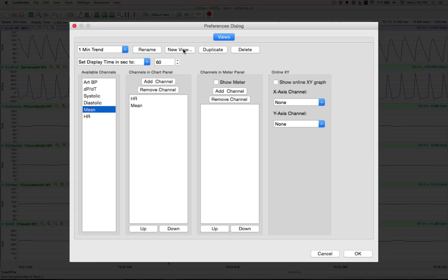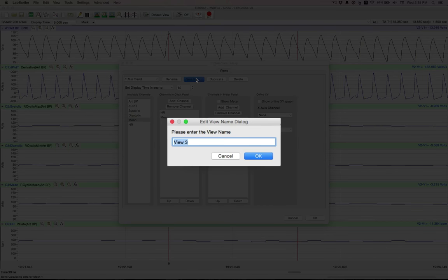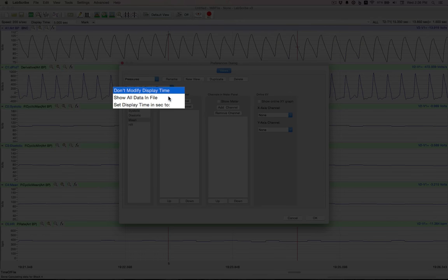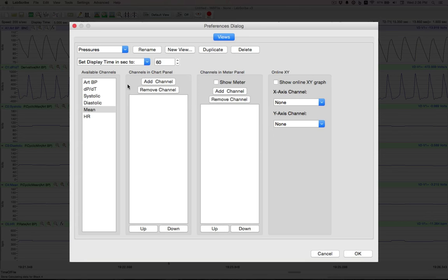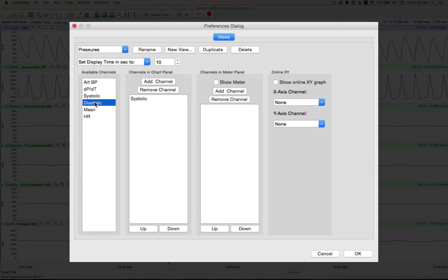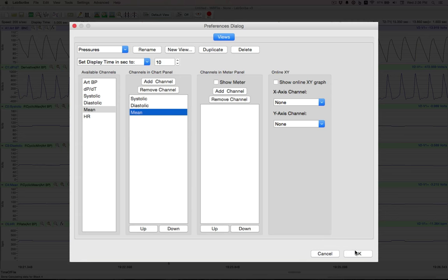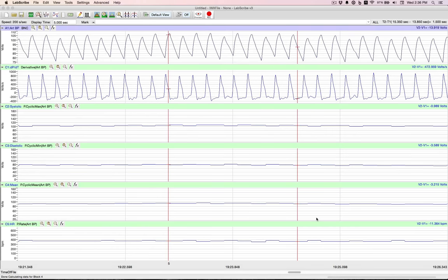Now for our other view, make a new view. Just call this pressures. Hit OK. This one we're going to make 10 seconds. And we'll add our systolic. Our diastolic. As well as our mean. Now you can also move these up and down if you want to adjust them. We hit OK.